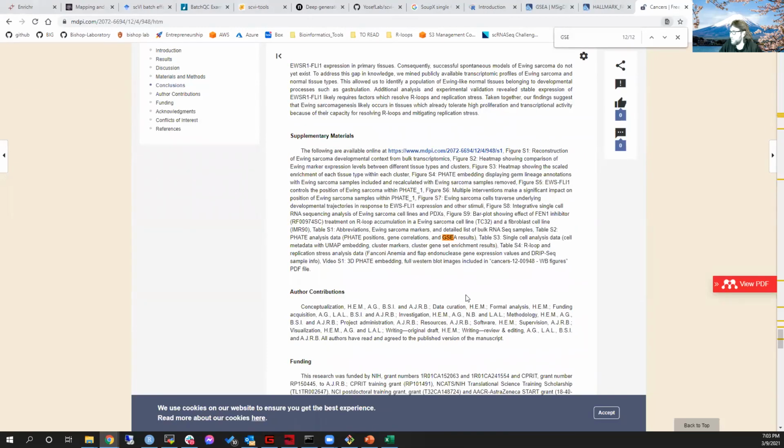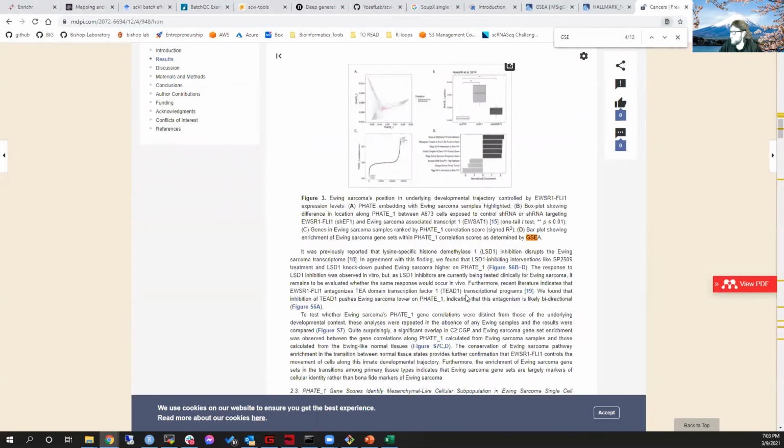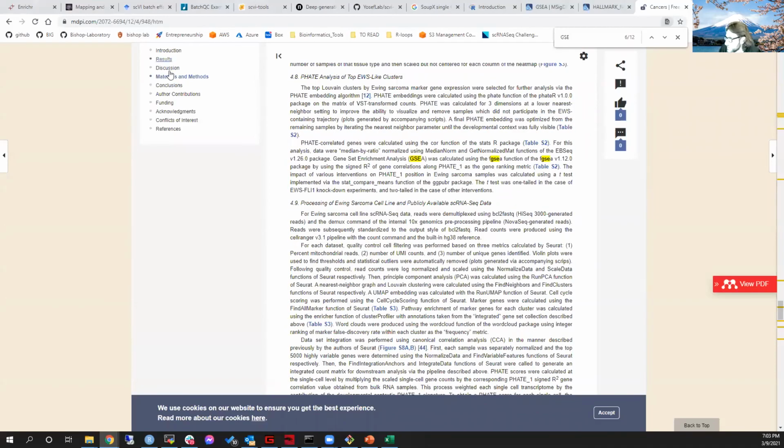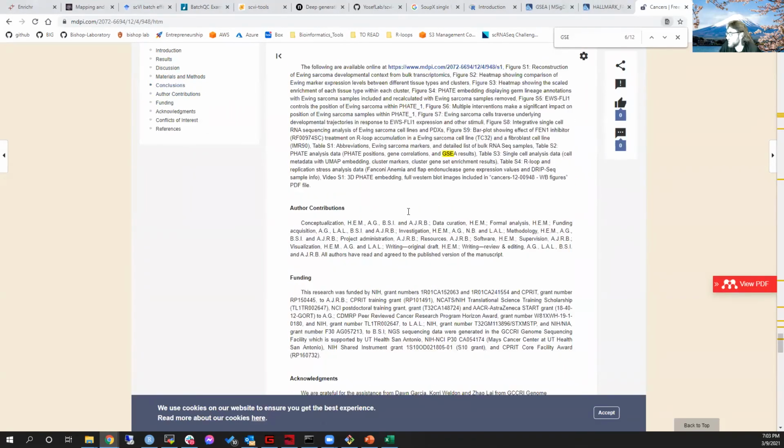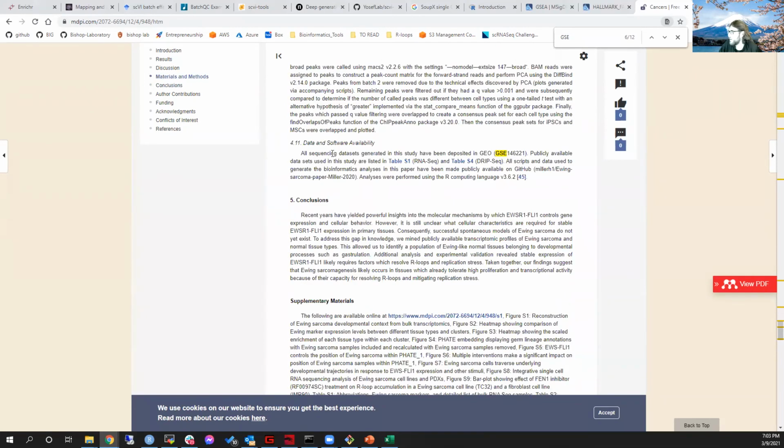All right. Wait, where are my data sets? I included that section. Oh no, that's not good. Ooh, I'm going to get in trouble for that. Oh no, there it is. No, it's there. These are fine. I got those. I was just mixing it up. I thought that I was supposed to download also this matrix CSV, but that's the downsampled one. I got it now. I was just mixed up. Okay, gotcha. Sorry.